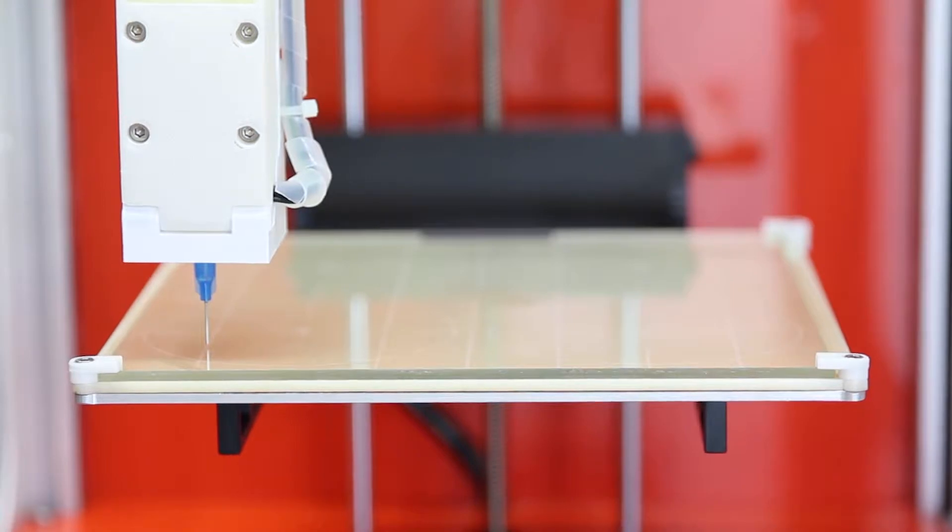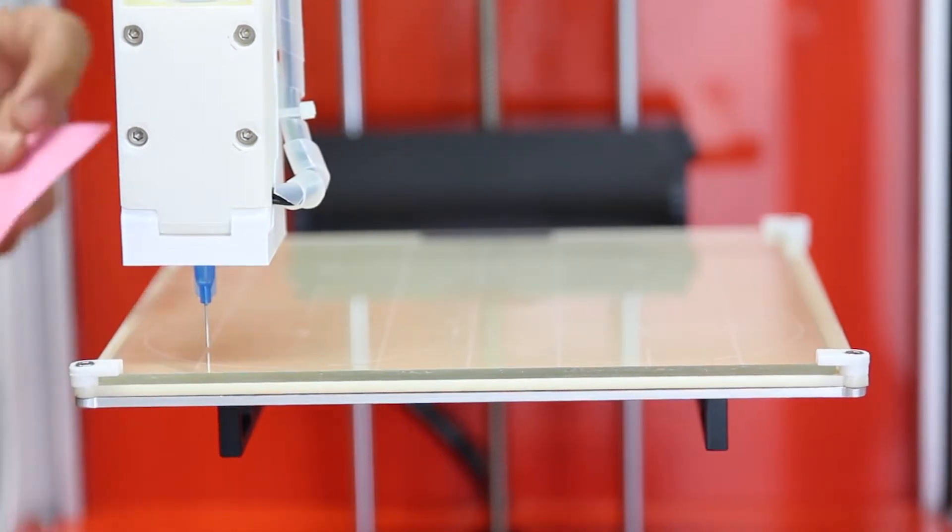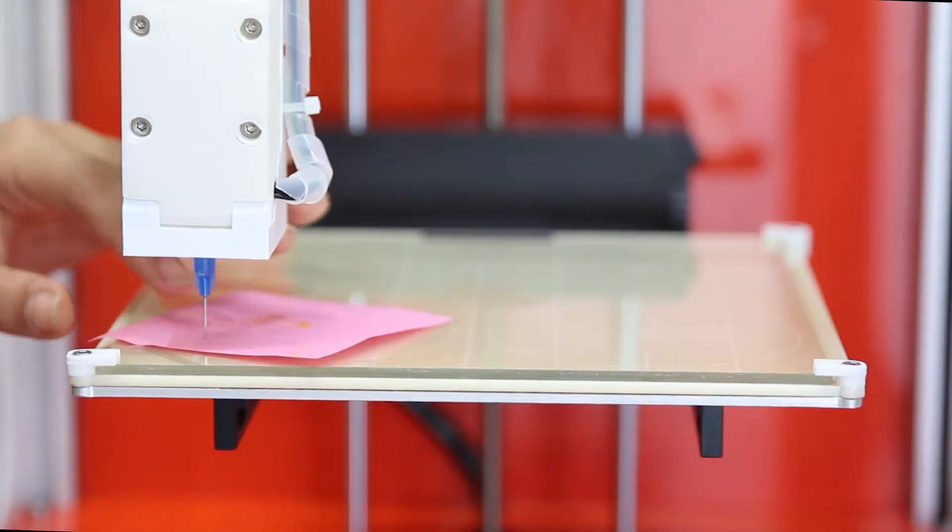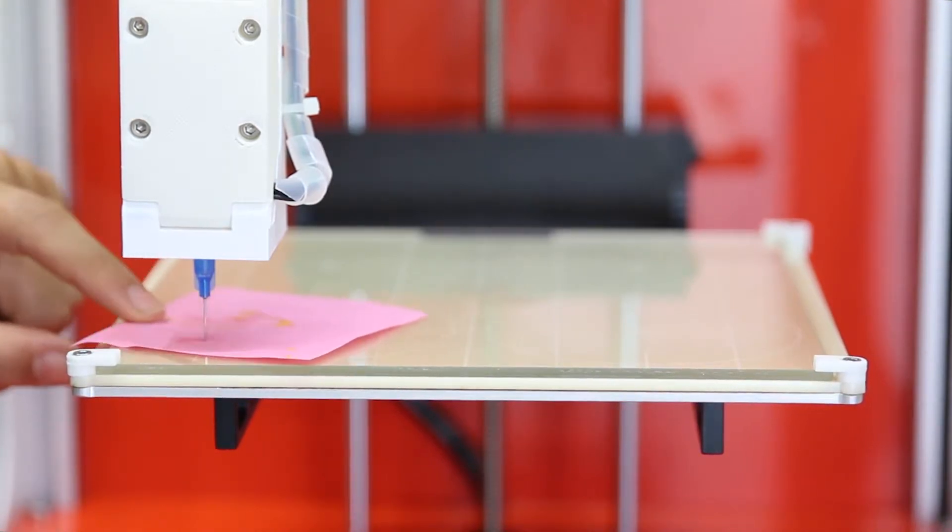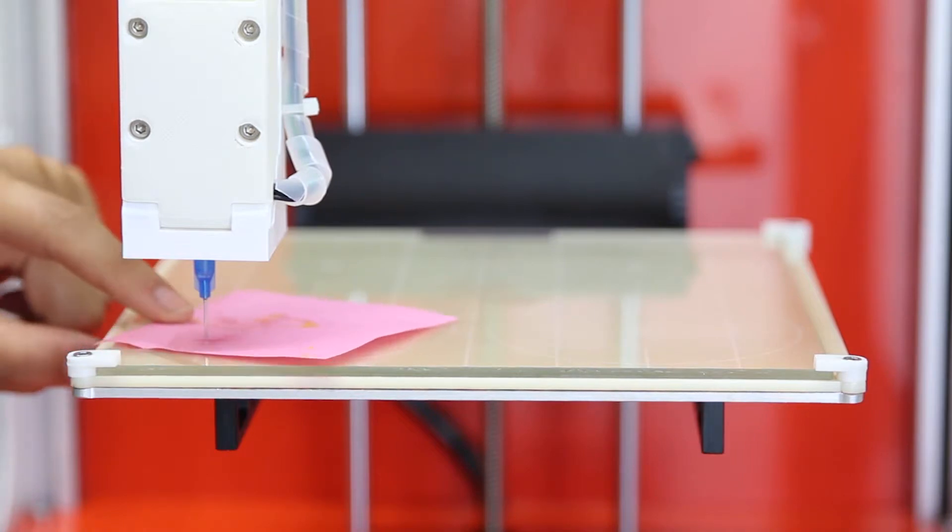Next, prime your syringe and set the Z0 position. If you are printing on the glass bed, set the Z0 to the glass. If you are printing on a template, print it to the lowest position on the template.